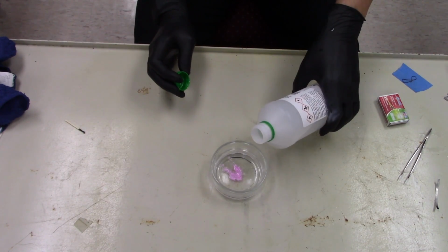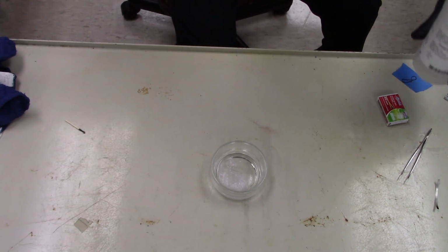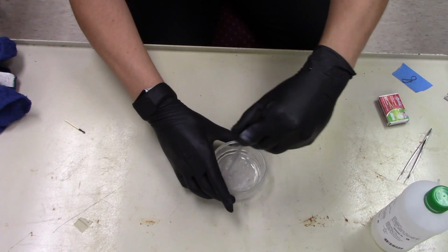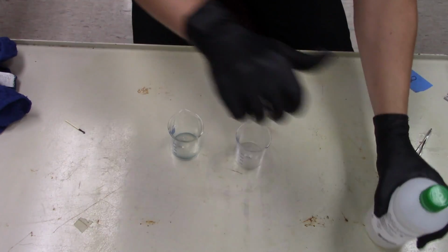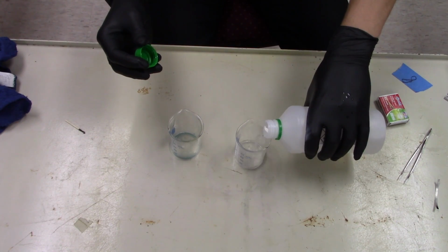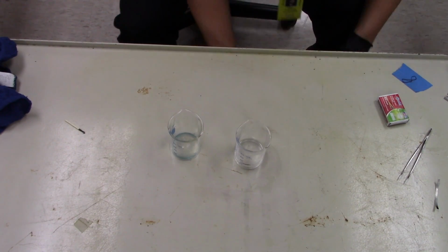So if I dump this stuff called phenolphthalein in here, oh, it didn't really do anything. When you mix basic materials with phenolphthalein, they change color. I'm going to set this off to the side and see if we can get that to pop up for us in a little bit. But I can do two different demonstrations here. So I'll take this. And this.